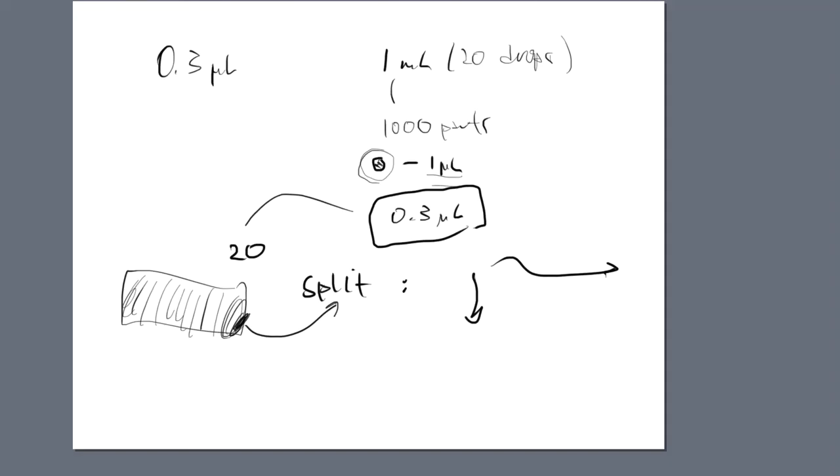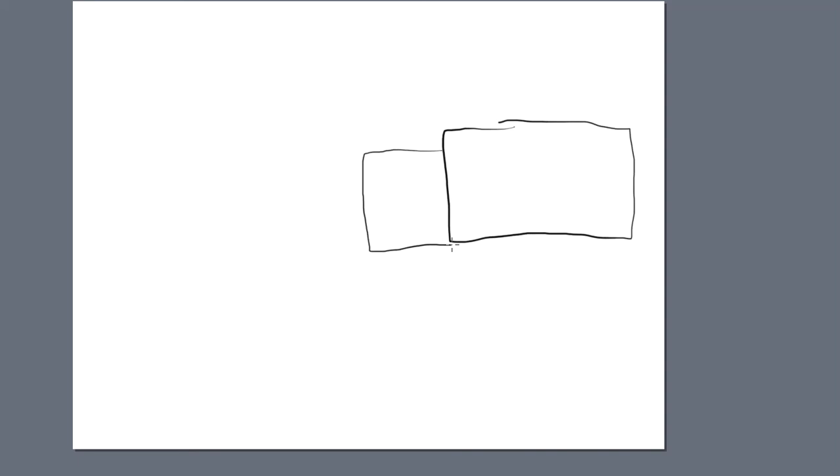All right, guys, I want to explain that a little bit more, and I'll do that with a very quick diagram. The way our system is set up, our GC box is sitting over here to the right-hand side, and then this other box is sitting to the left-hand side of that. This is the GC system, and this is the MS system, which is what we're mostly focused on here. I'm drawing the diagram because there were two temperatures in there that were very important, and one was the ion source and one was the interface.